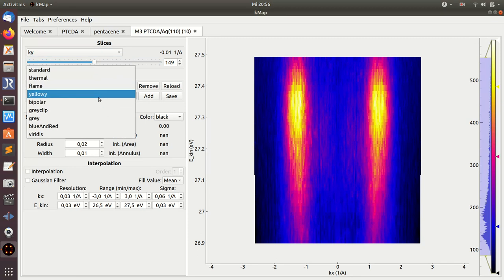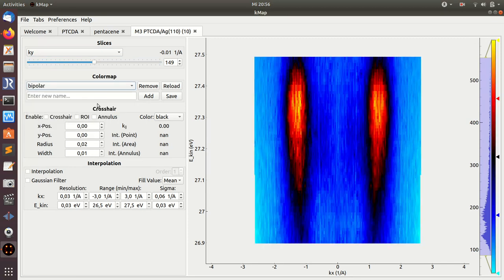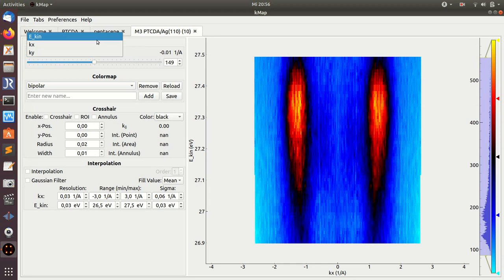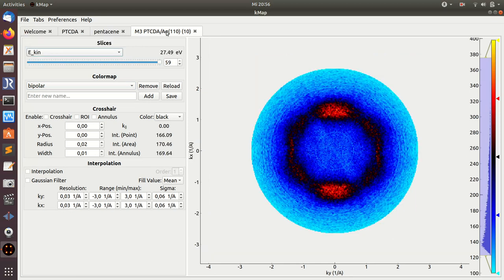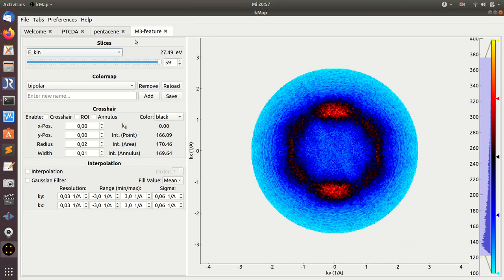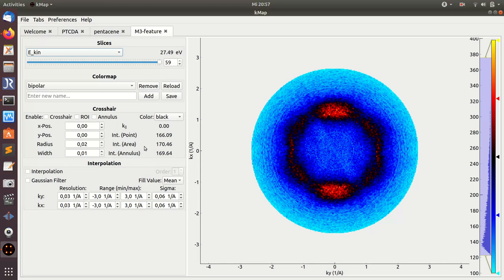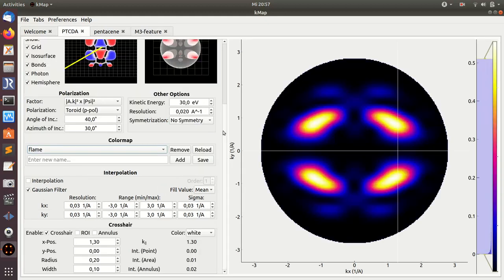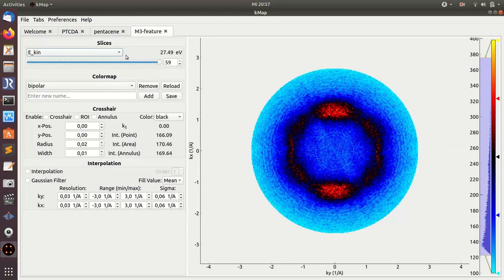Okay, I can also change the color of course as usual, and by double-clicking on the button I can also change the name of this tab. Before I explain, I think I'm going to explain these features of the crosshair and the interpolation in a different video. By the way, this crosshair and interpolation features are also available and have the same functionality on the orbital data tab here, but as I said, I will explain this later.